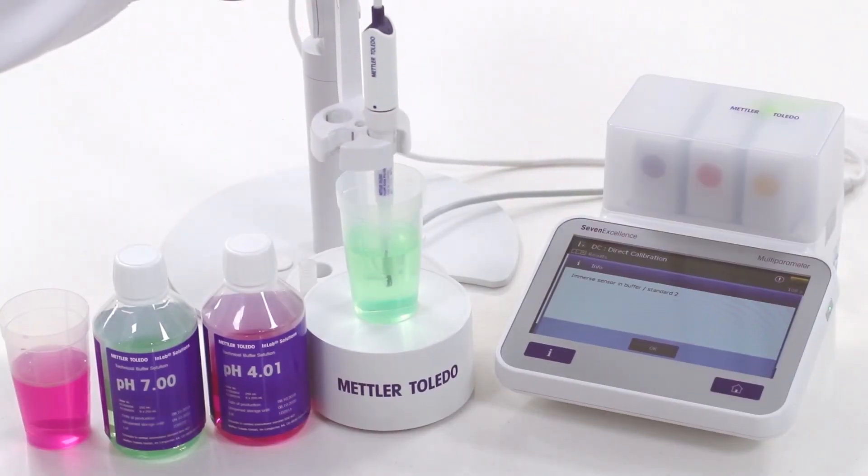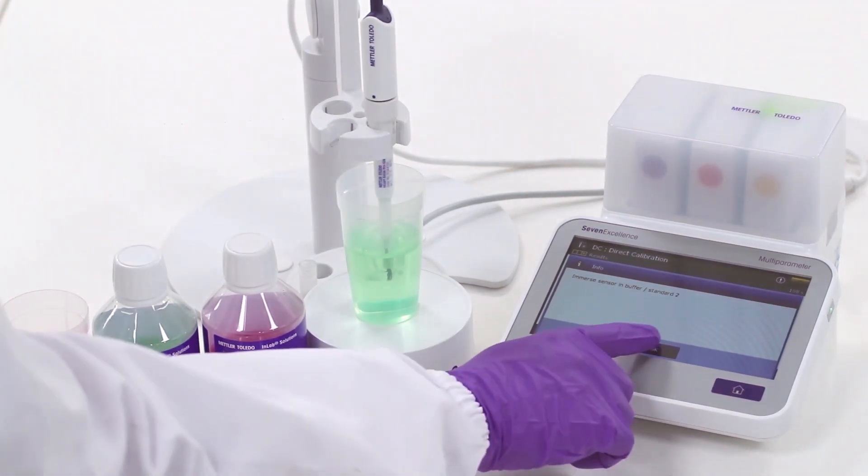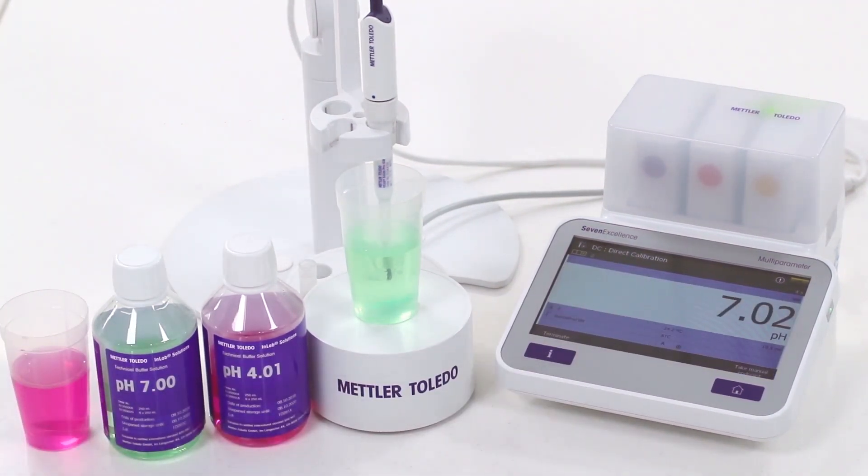Calibrate the electrode with pH buffer solutions from Mettler Toledo. Use the buffers to bracket the sample pH range.